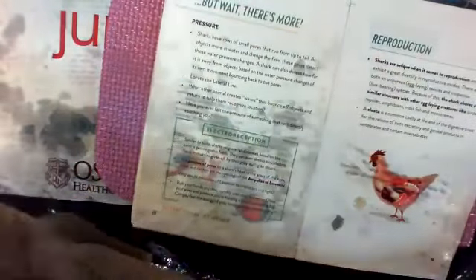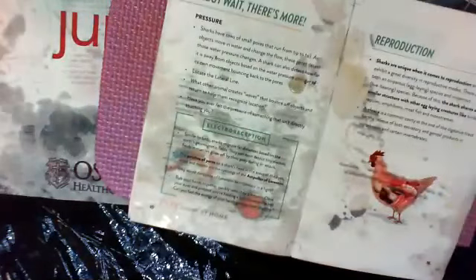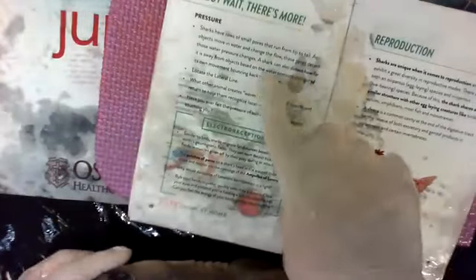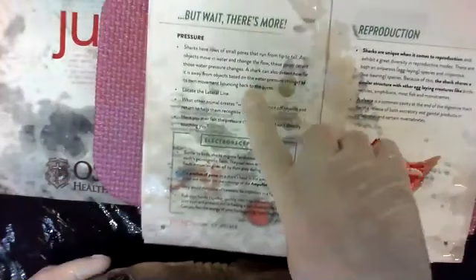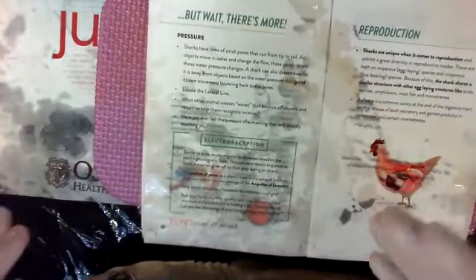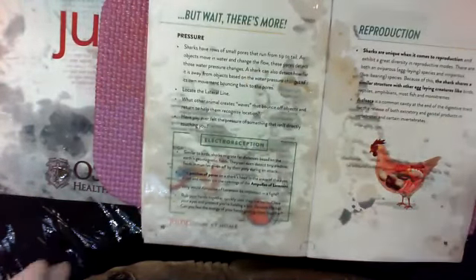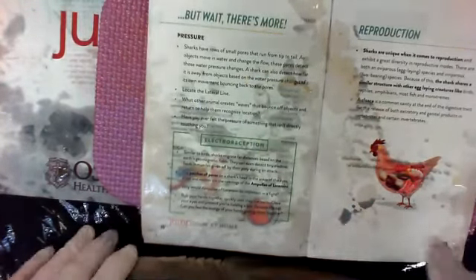If you ever see sharks that are circling, if there's something in the middle and they're moving around, they can feel the water waves bounce off that thing and come back to them, and they can localize where it's at. So they're constantly trying to figure out where this thing is. That's the lateral line, pressure system. And it actually syncs together with hearing, so it's almost like they hear the pressure, which we actually do hear pressures, but it's a long story.